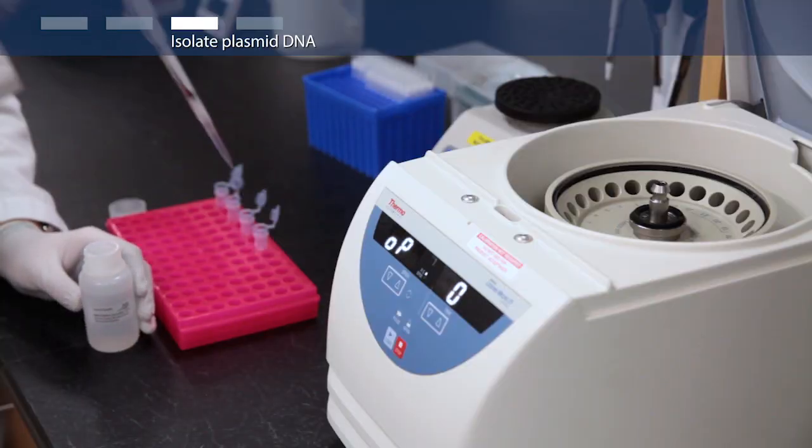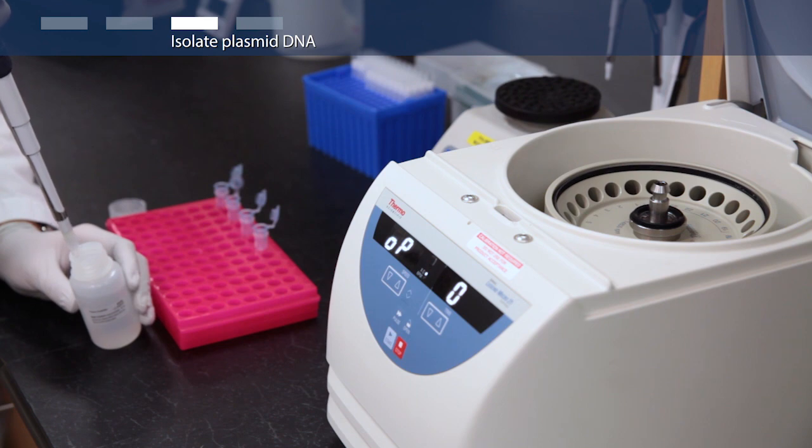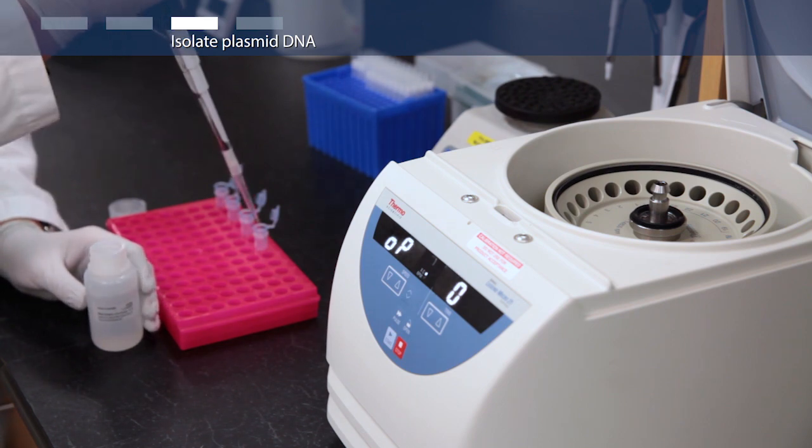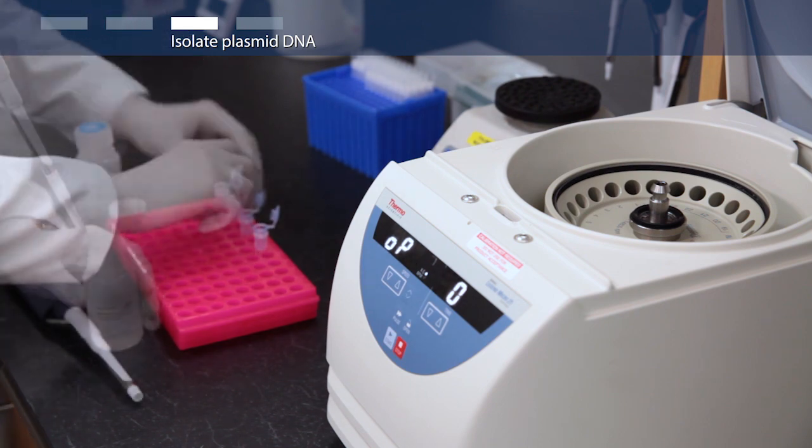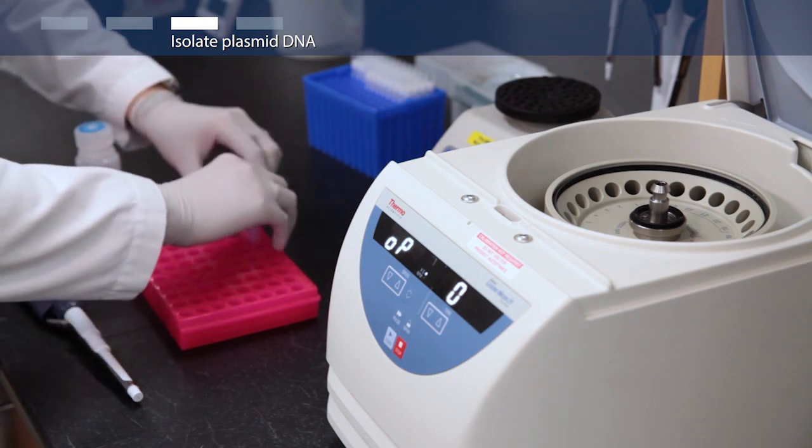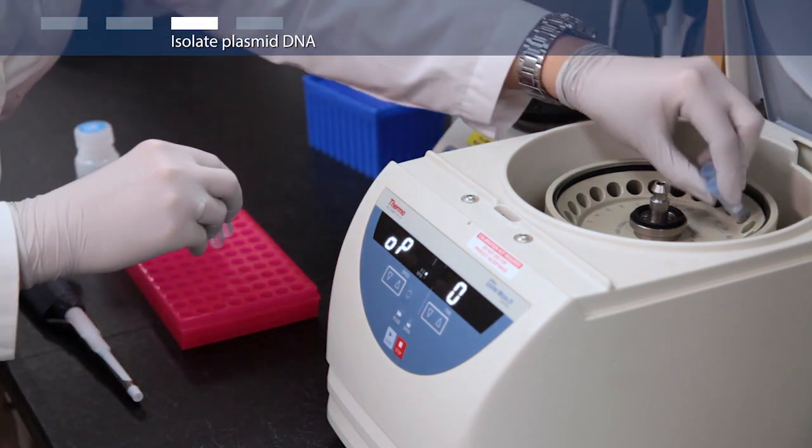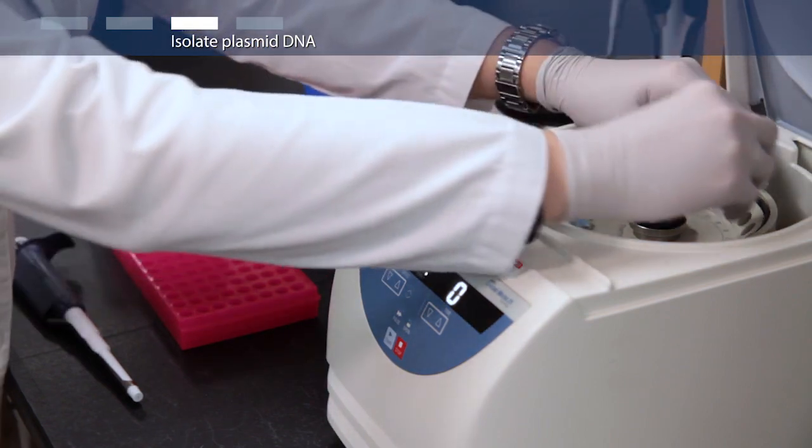Add 500 microliters of wash solution to the gene jet spin column. Centrifuge for 30 to 60 seconds and discard the flow-through. Place the column back into the same collection tube.